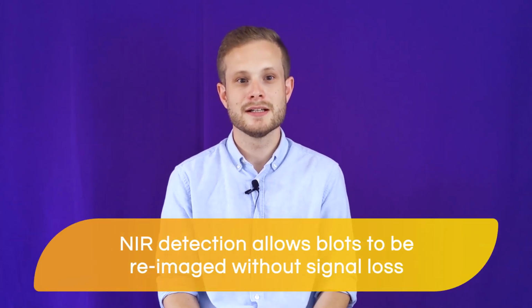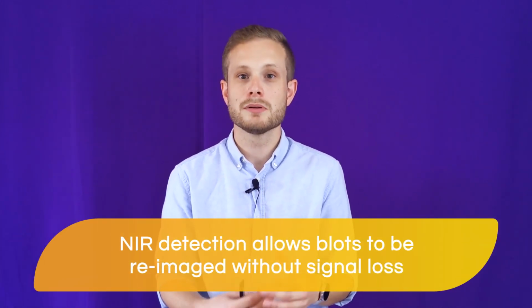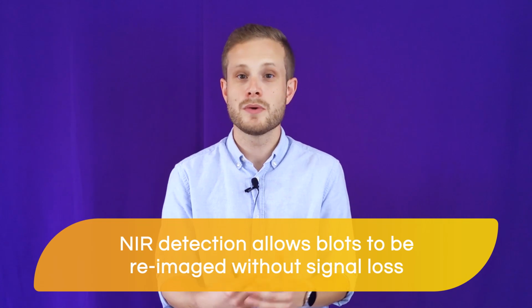If you do find that you have signal saturation in your image, don't panic. The beauty of NIR imaging is that, provided they were stored correctly, blots can be re-imaged again and again without any signal loss. You would simply image your blot again, this time with slightly reduced sensitivity or intensity settings on your imager to avoid the saturation, bearing in mind, of course, that weaker signals from the original image may not show up in the new one.